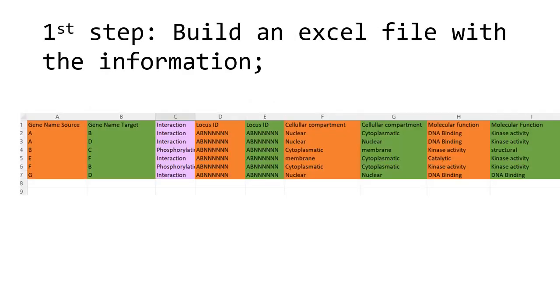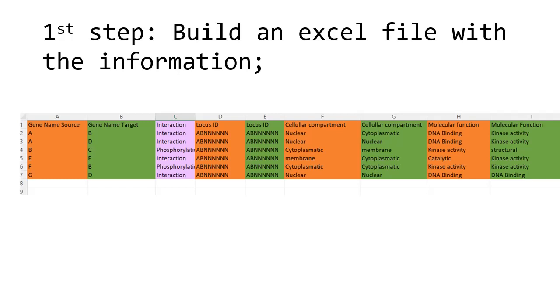The first step is to build an Excel file with your protein information. If you notice here, I have a gene named source, a gene named target—source and target is nomenclature that Cytoscape uses when referring to their nodes, even if it's a simple interaction or gene information between genes. Then you have interaction information, and this is why I advise you not to create a table but instead just use the normal columns in the Excel, because then you can have the same attributes for each source or node or target. This will facilitate when you are loading your table into Cytoscape.